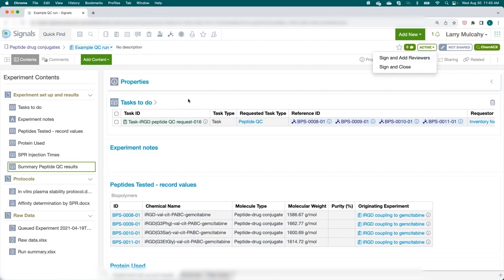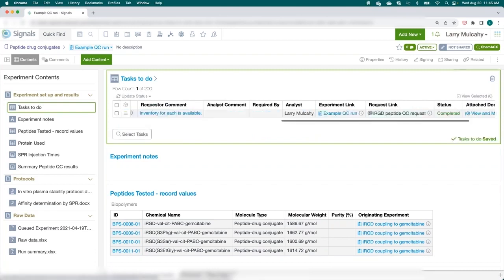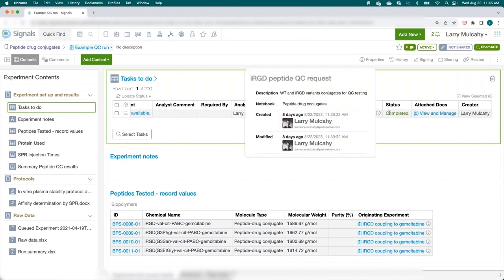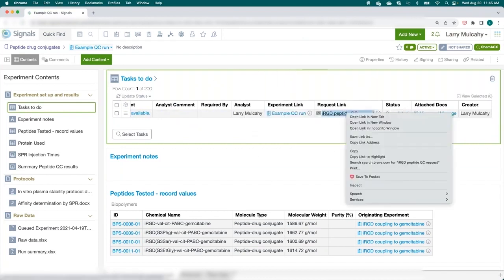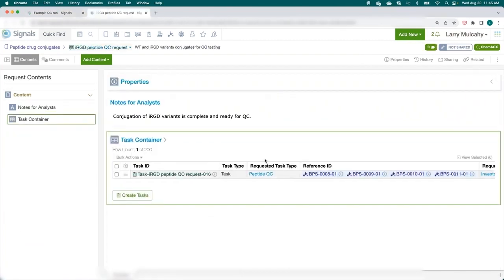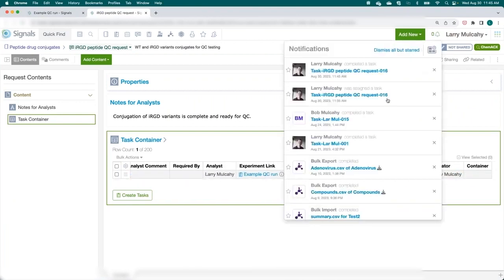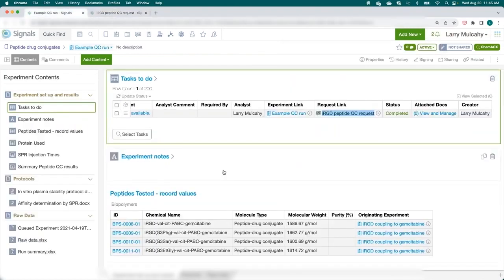But when you have a task as part of this, when it's integrated into that handoff of work, really you want to be able to complete the task at the end. So acknowledging that all of the data is done, that task status goes to completed, which I will see on the dashboard, which I will see on the original request for that 360-degree view. This is the actual request that started it all off. And because I'm self-assigning and self-completing here, you'll see within my notifications and then within my email that I'm getting that information here too. So you can see I was assigned the task and you see the task was ultimately completed. So that lets you finish an experiment from end to end.